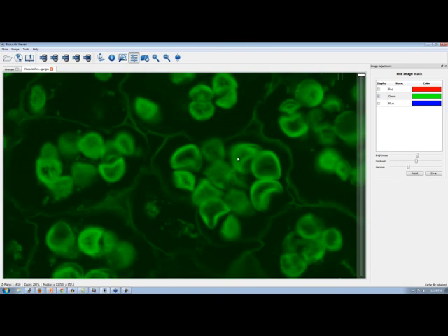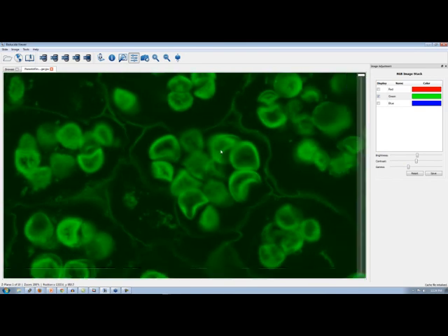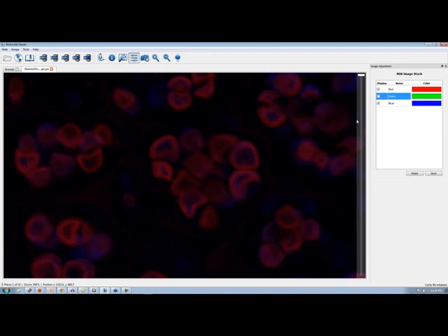I guess the next thing that comes to mind is once you have something like this, I might want to grab screenshots of, let's say, all 3 channels independently or all of them together. Can I do that here? Can I just grab a screenshot of what I'm looking at? Yeah, exactly. You can get it looking exactly the way you like. Turn channels on and off, change brightness however you want. And then there's an icon up here with a little camera.